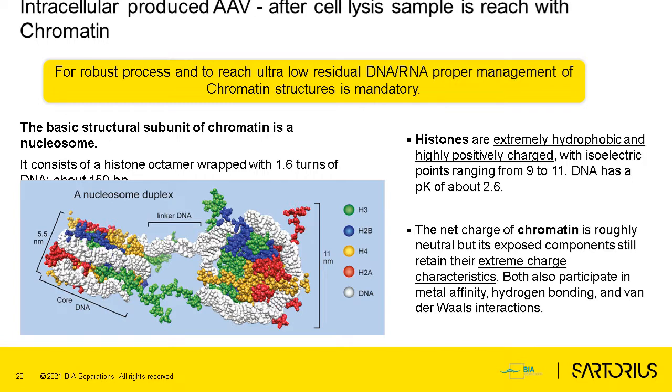We can think about DNA treatment. We can partially remove these structures, but we need to keep in mind that when the DNA is packed inside such a complex, the enzyme is excluded. No chance for the enzyme to digest such chromatin. It could be even worse. It might not be possible for the primer to amplify our residual genomic DNA, and we might think we have no residual genomic DNA in our sample. So we also need to pay attention to this.